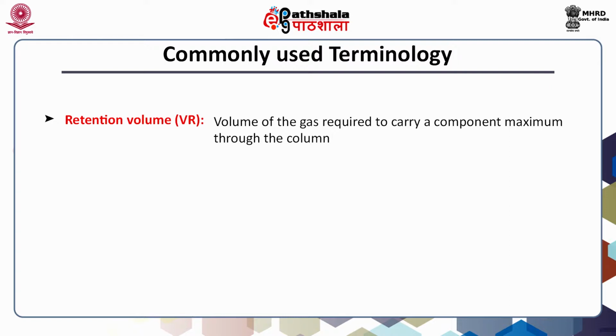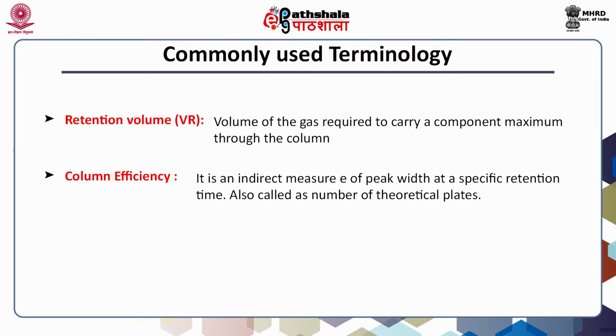Now, this is basically, as the name indicates itself, denoted by VR, and it is the volume of the gas required to carry a component maximum through the column. Another very important terminology which is used in the study of columns is the column efficiency.